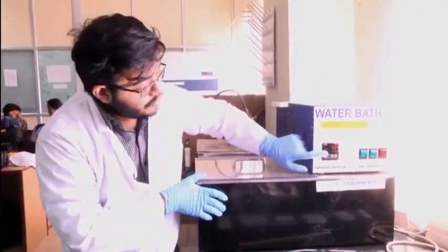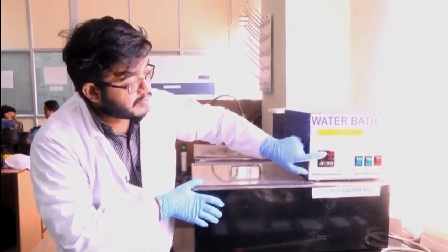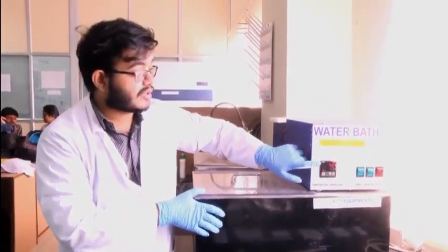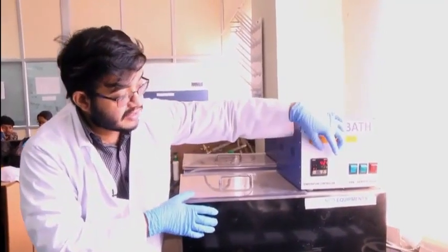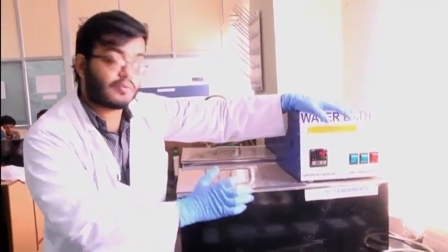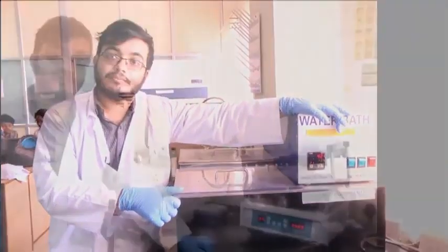So not just 42 degrees, for some purposes it might be required at 56 degrees, for some purposes it might be required at 35 degrees. So you can adjust the temperature and use the water bath for that sort of purpose.